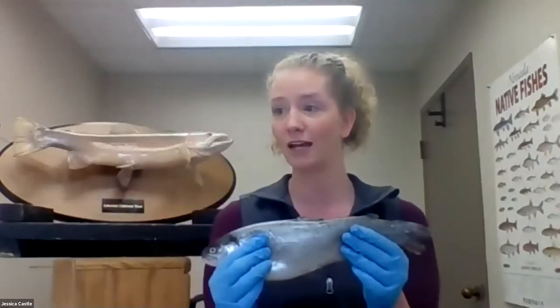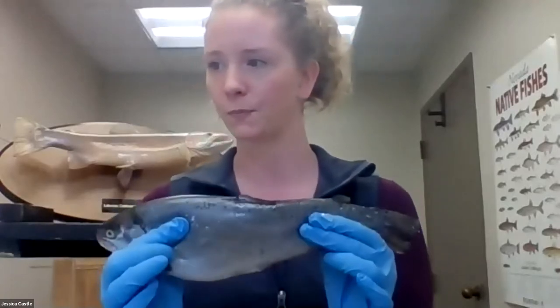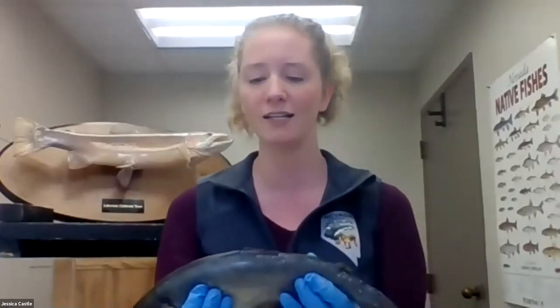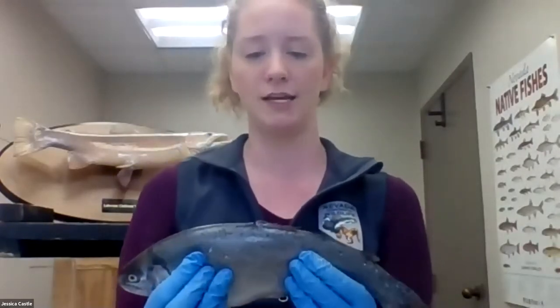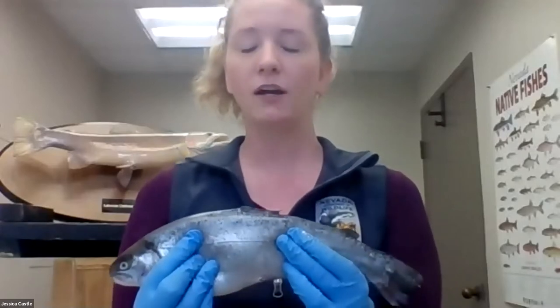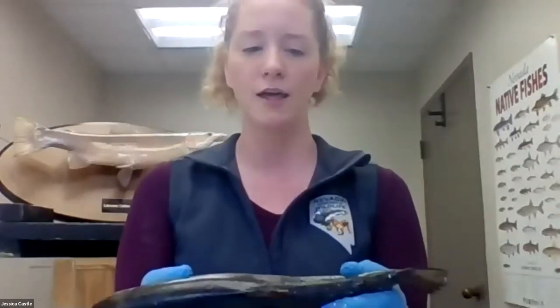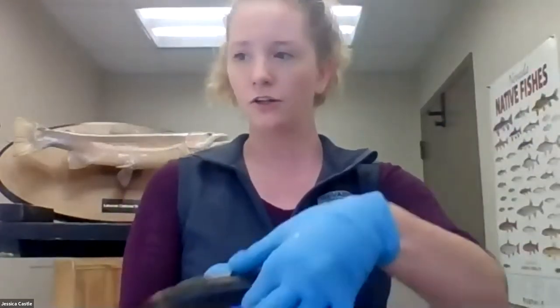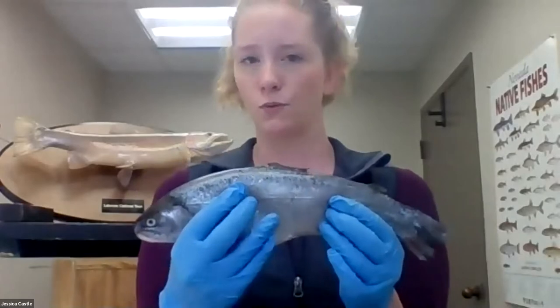We're seeing great guesses in the chat: protection against bacterial infection, easier to swim, protection. You are all right on. The main function of the scales is for protection of the fish — it is an outer covering that is going to protect them. In addition to being an outer covering, they also have different colors that help the fish as well. The top of the fish is pretty dark, and that is a type of camouflage. If you imagine you're a predator — maybe an osprey — looking down on the trout, this dark color is going to help it blend in with the stream bottom.